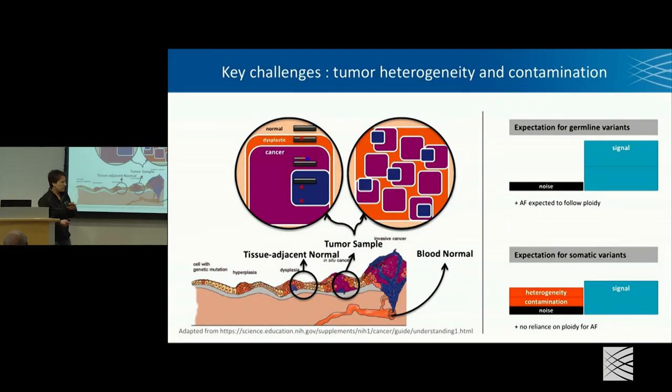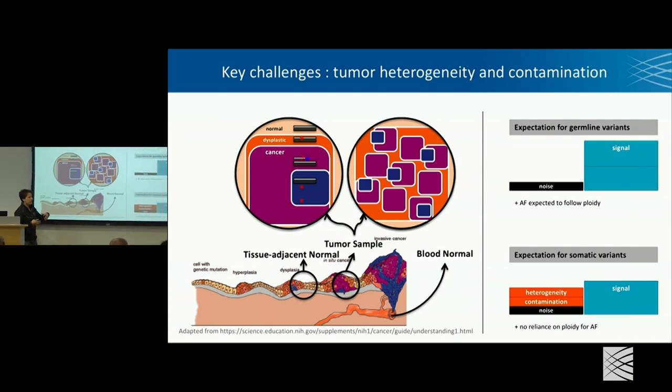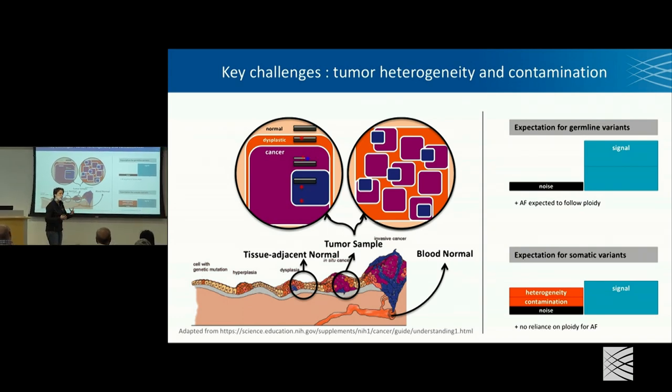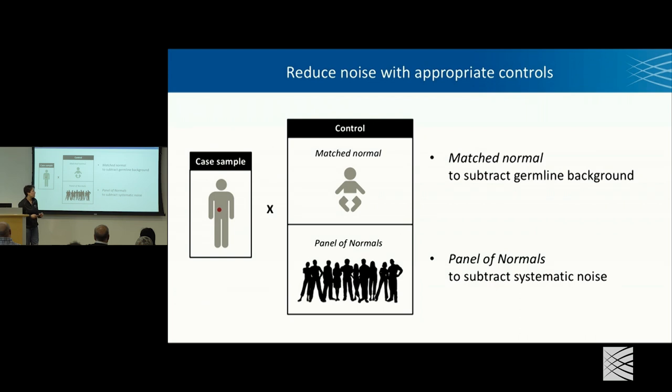Somatic short variants. The challenge here is that when you have, and specifically in the context of cancer, when you have a tumor that's growing, there's a lot that's happening, there's different cell lineages that are involving its evolution within a little microcosm. And so the problem for us, from the point of view of calling variants, is that you don't have just the usual technical noise and difficulty, you also have problems of the tissue is heterogeneous. There's contamination between unaffected cells and cancer cells and so on. And so we have a number of additional steps, approaches to do to tease aside those effects and produce confident variant calls.